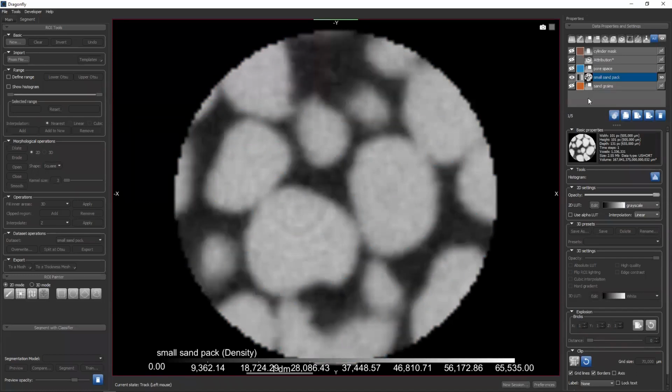Here's something you have not seen yet before. These are what we will call filter buttons. I can click all and I see everything, or I can click this button and I'll only see data sets, or I can click this button and I'll only see ROIs. If this list gets very long, if you've got a bunch of measurements or a bunch of ROIs, you can filter what you're seeing, or I can see data sets and control click, see data sets and ROIs, or I can see everything or only those things that are visible.